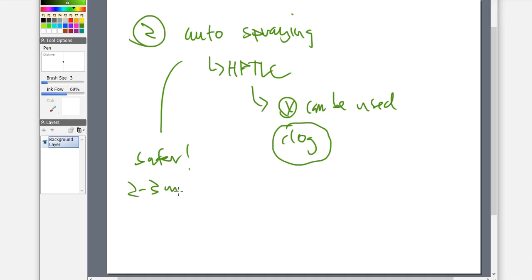It only needs like 2 or 3 milliliters of indicator in order to do this job. So it doesn't take a lot of derivatizing agent at all in order for it to give you a very good result. But the drawback, you can't use it for all. Sorry, you've got to kind of figure out another way to do this.